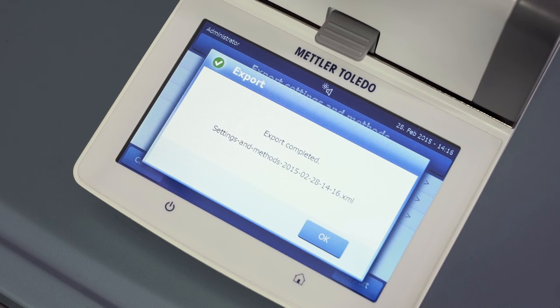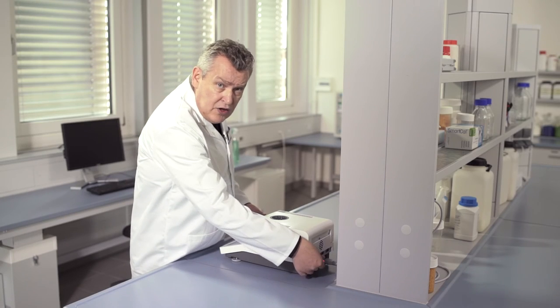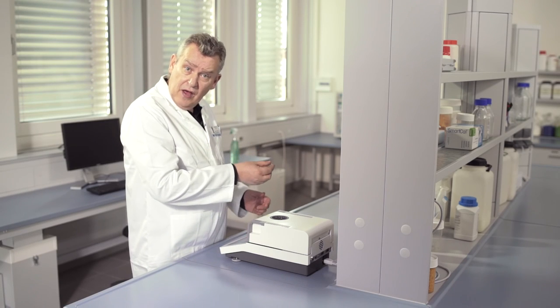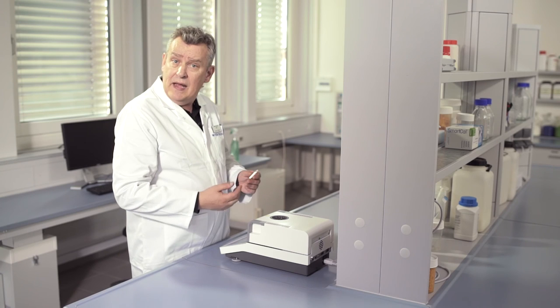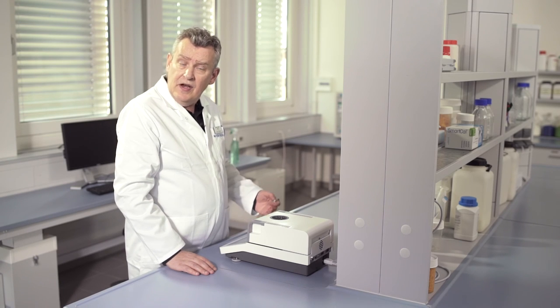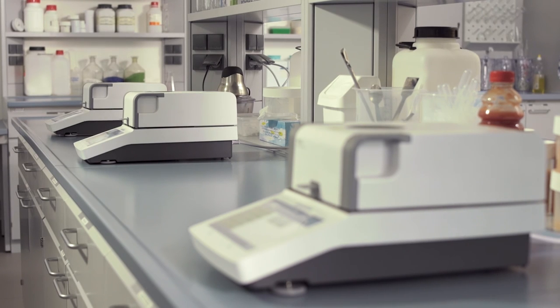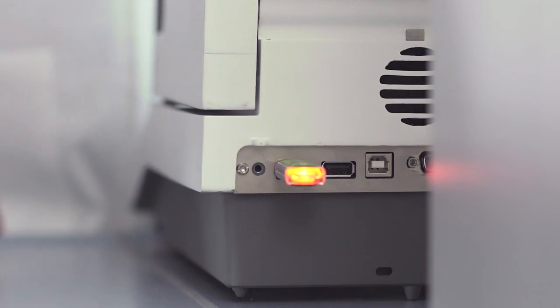When this is done, unplug the USB flash drive, and plug it into the other units, and simply import the settings. In a matter of seconds, all of your units have the same settings as the master instrument.